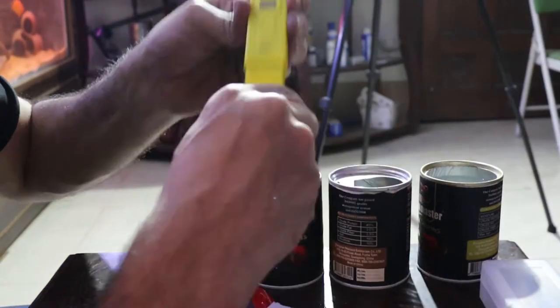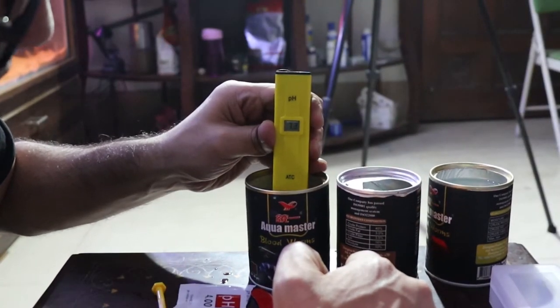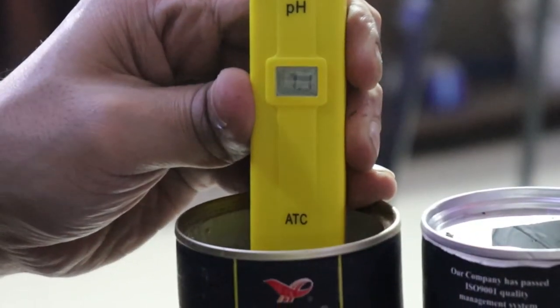First of all, you need 3 containers with 250 ml of water each. This water can be distilled water or reverse osmosis water. The water should be 25 degrees centigrade so that the calibration can be accurate. Now, take the 6.86 buffer solution, put it in the first container and mix it well. Do the same with the second and third containers using the 4 and 9.18 solutions.